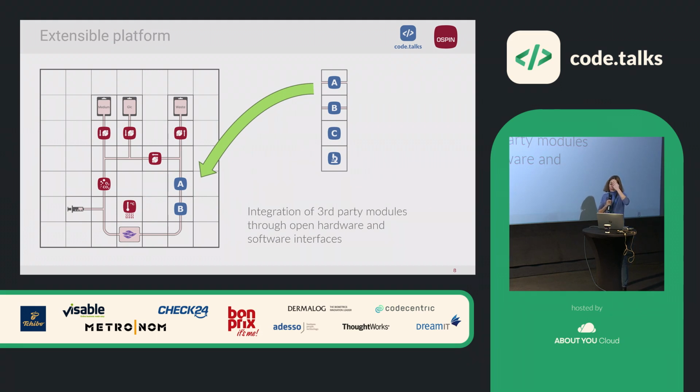We have a partnership with a university in Erlangen, which is in the south of Germany. They developed a setup to observe cells. They took a camera and a motor, and they built a setup which is a microscope, a cheaper version of a microscope, which is cool. But now, if you want to sell it, this thing just does one thing. So either you really need a cheap microscope, or you don't buy it.